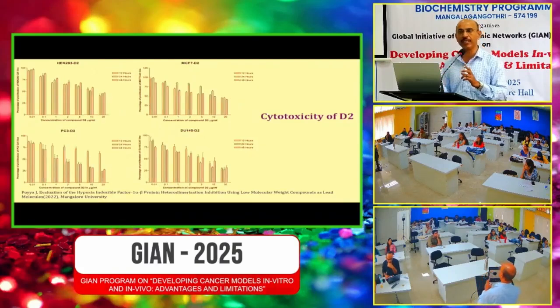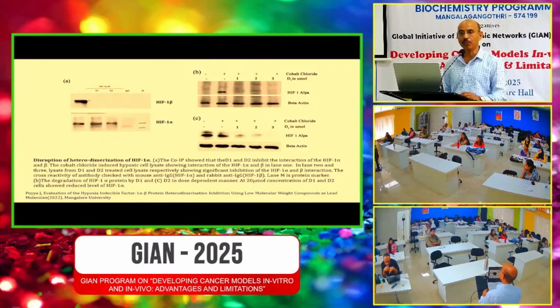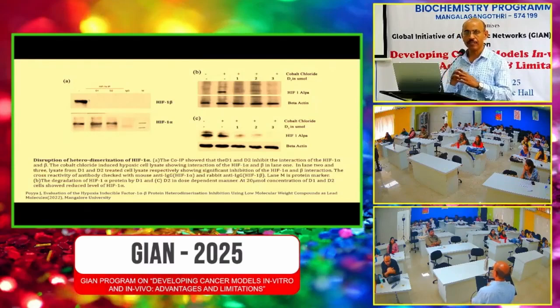The same thing happened with the other drug. That drug also showed a similar trend, where it was active against the cancerous cell, but lesser active against the non-cancerous cell. And as I told you, we wanted to show experimentally that it is actually acting. We wanted to show the molecular mechanism, that it is preventing the HIF1 alpha, HIF1 beta interaction. So we wanted to find out how exactly it is preventing the alpha beta interaction.